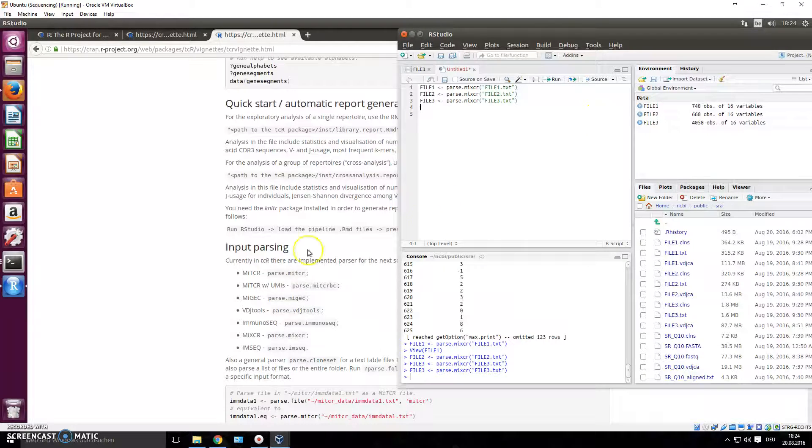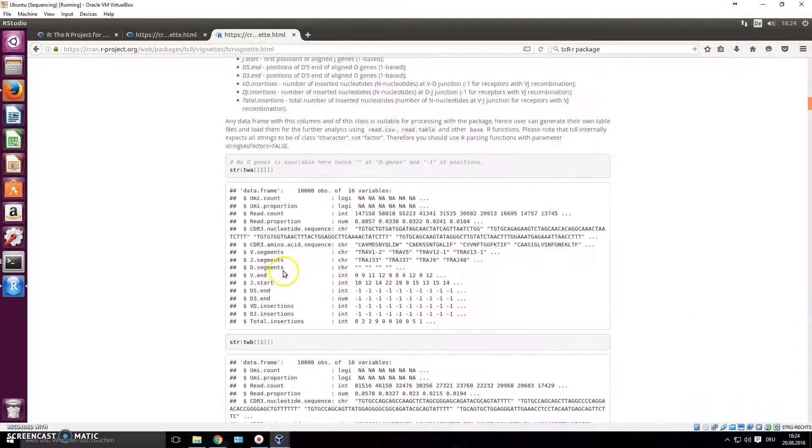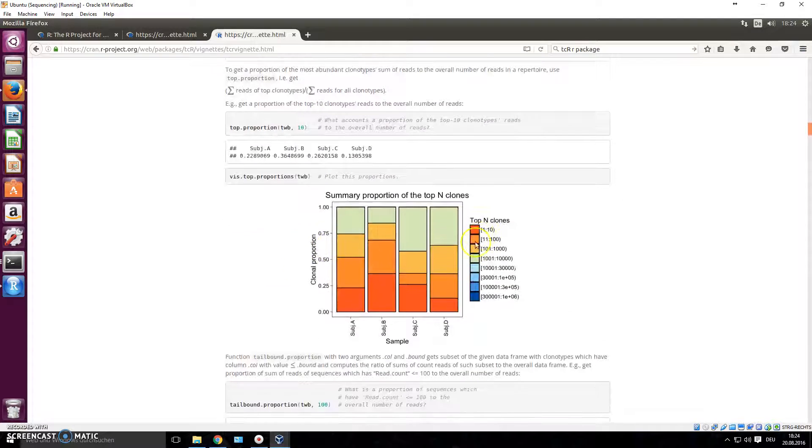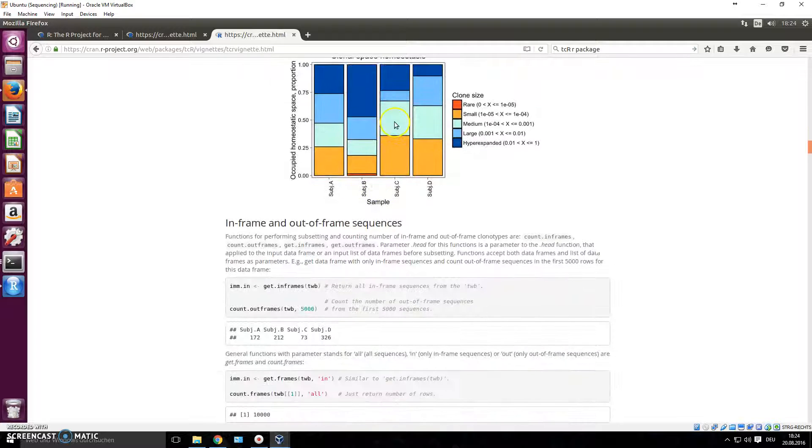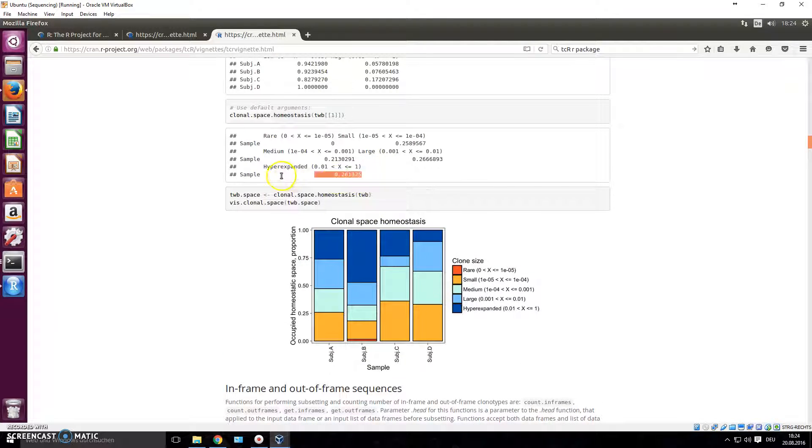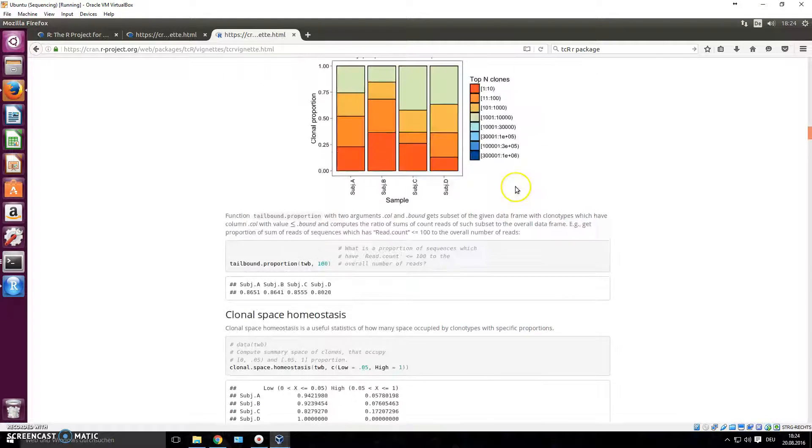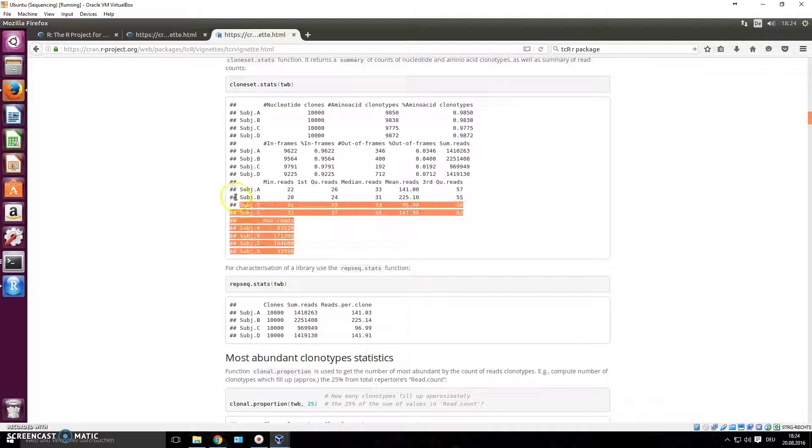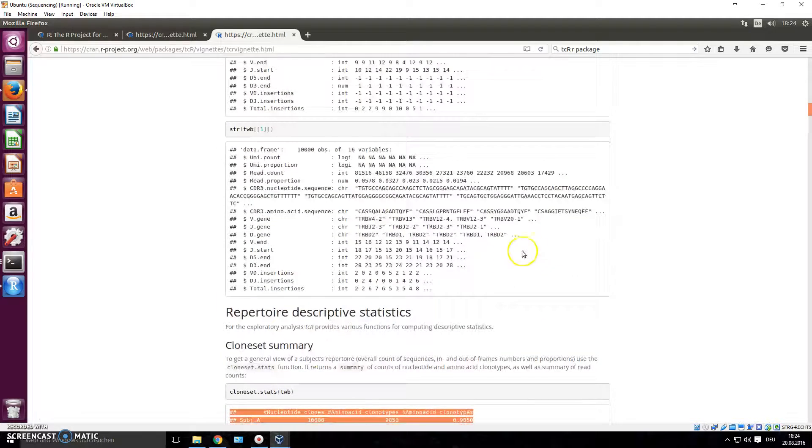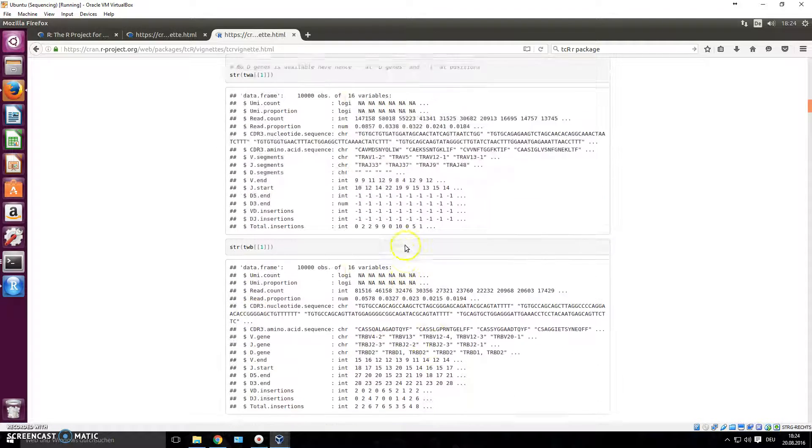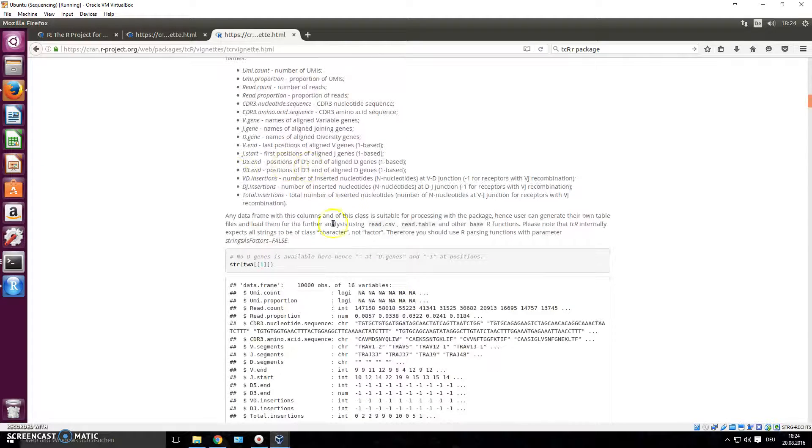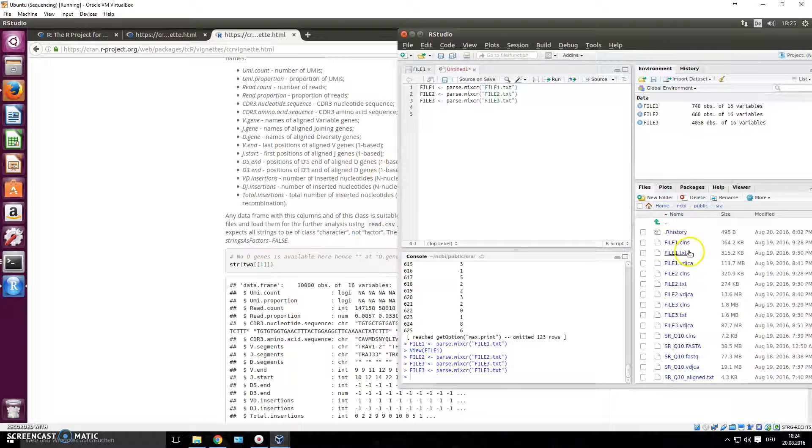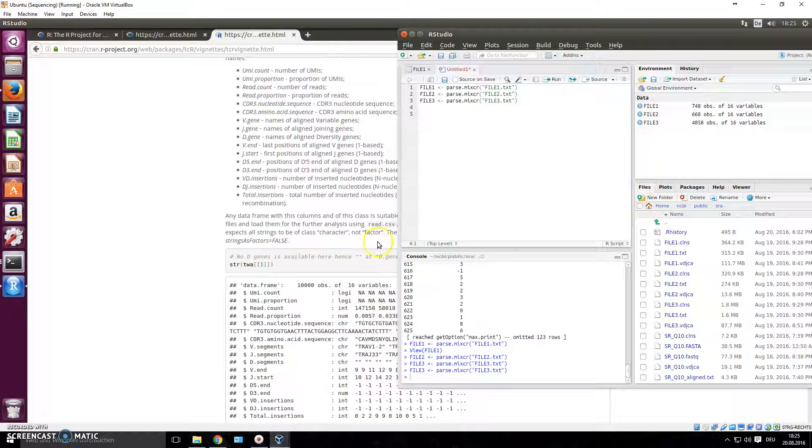We want to try out this package now. What can it do? Once we've parsed it, we can now actually get into doing the analyzing and getting nice graphs such as these right here. You know, you can make these graphs very easily. You can get statistical data, just print statistical data out and have it as an output format, just saved as a text file with a lot of information about what you have in your files.